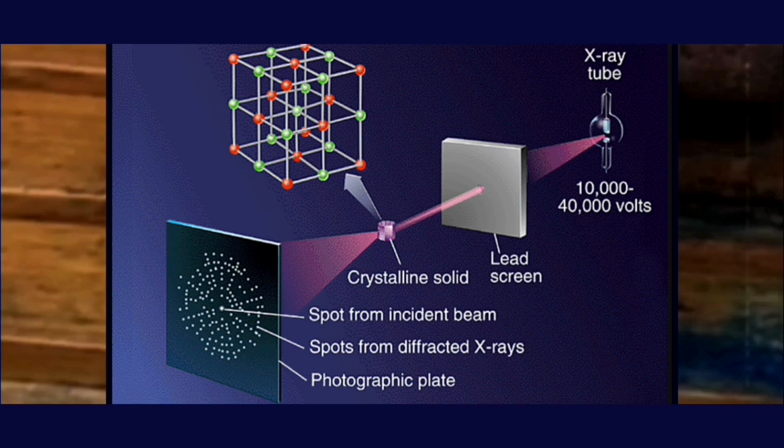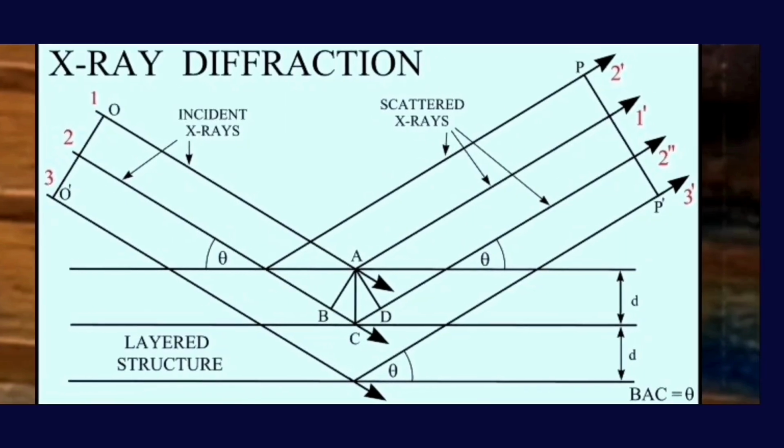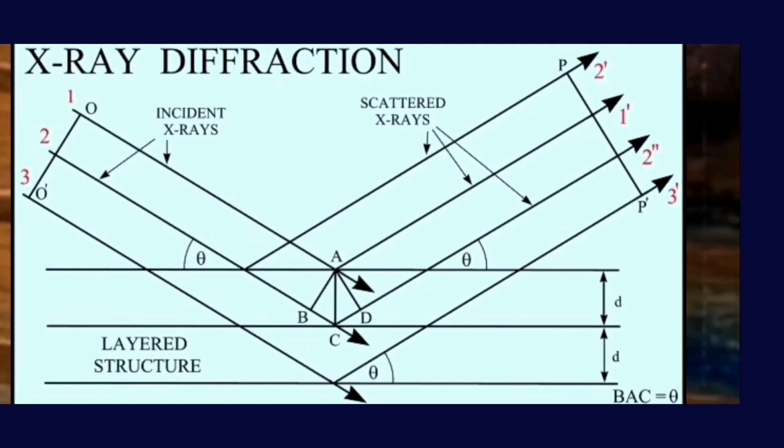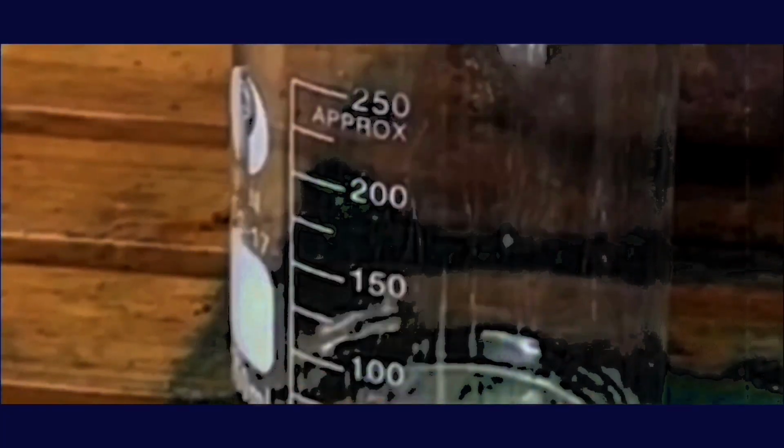Hexamine is of historic significance since it was the first organic crystal to have its structure determined by X-ray diffraction almost 100 years ago. Agglomerated microcrystals connect and fuse together. Intercrystalline mother liquor becomes trapped, forming a symmetric pattern of solvent inclusions. It crystallizes in a body-centered cubic crystal structure, creating a highly symmetric dodecahedral morphology.